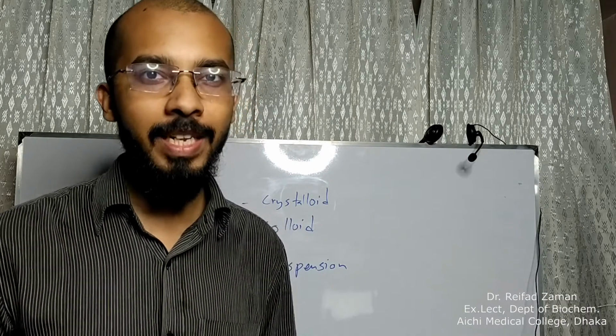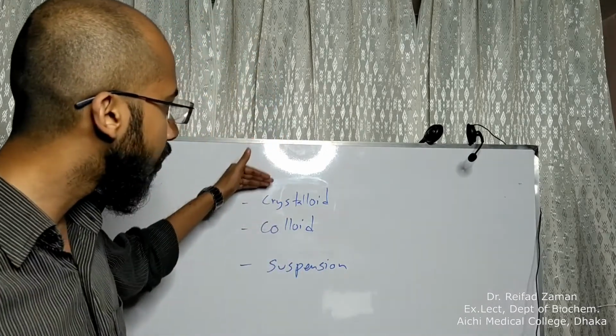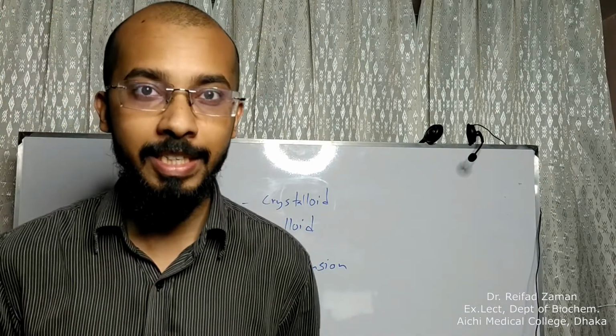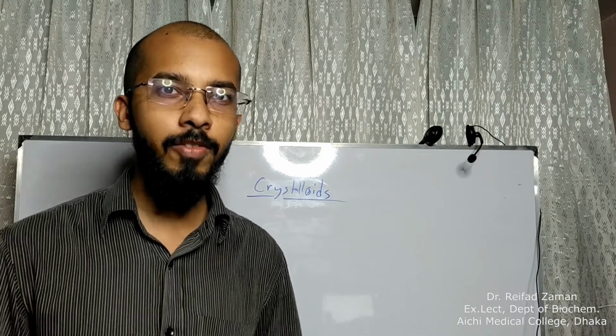Previously, we made emulsion, and in this video, we are going to make 3 different types of solutions: crystalloids, colloids, and suspension. In crystalloid, আমাদের যে সলিউটটা থাকবে এটা টোটালি সলভেন্টের মধ্যে ডিসলভ করে যায়.